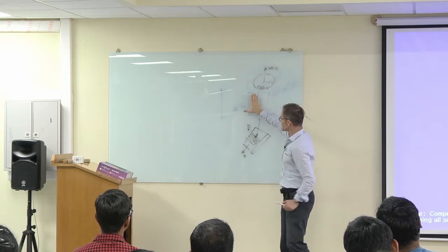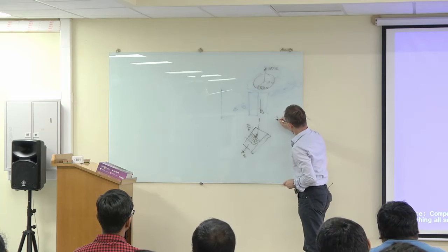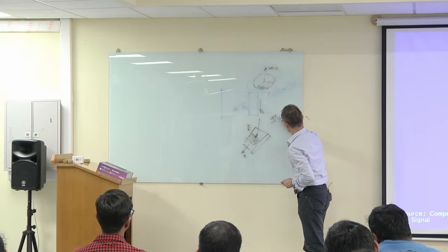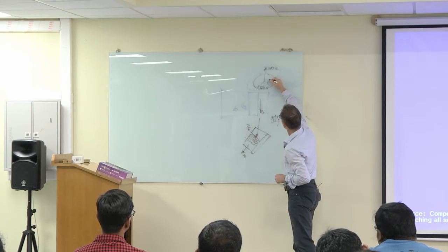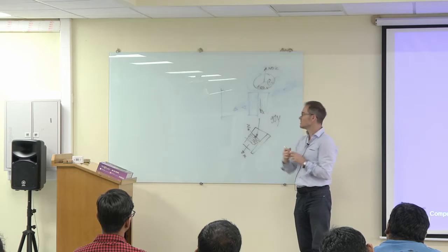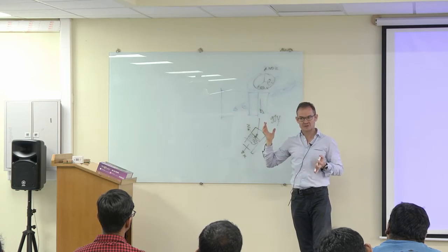So when I have measured my texture, the first thing I will do is a rotation of 90 degree around the Y direction. 90 degree around Y, so about that axis here. Then all the texture data will now be corresponding to the standard setup which you would select for a rolled material.